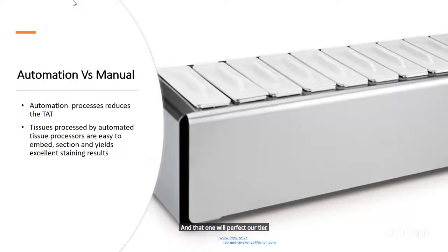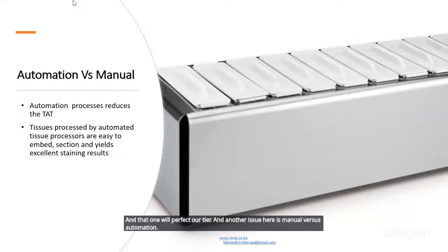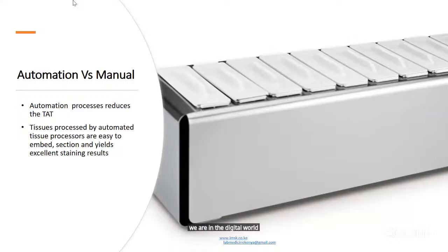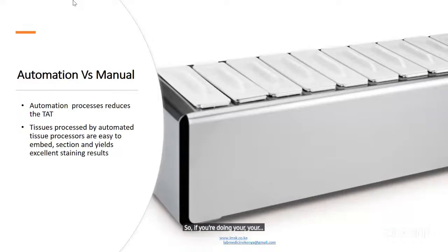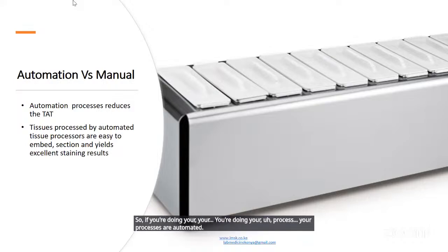Then another issue here is manual versus automation. We are in the digital world, and nowadays most of the processes are being automated. Of course, automation will reduce the TAT maybe by a day or two.